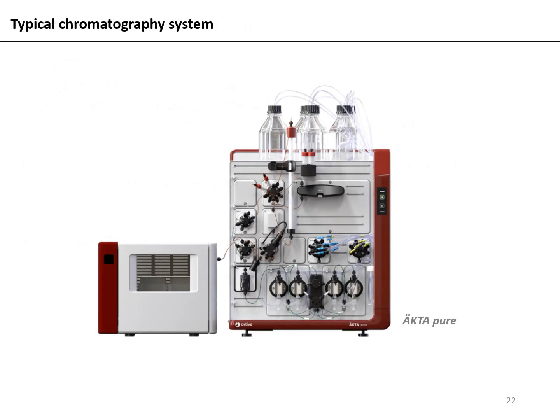So this is what a typical chromatographic machine looks like. Other than affinity chromatography, which can be performed on those gravity columns like I showed in one of the earlier slides, the other types of chromatography, like ion exchange chromatography, size exclusion chromatography, or hydrophobic interaction chromatography for that matter, require sophisticated instrumentation whereby the pressure that is applied is very tightly regulated. The flow rate at which your sample will pass through the columns is also very keenly regulated. So these machines have a series of pumps. As you can see, these are the pumps that regulate the pressure and the flow rate.